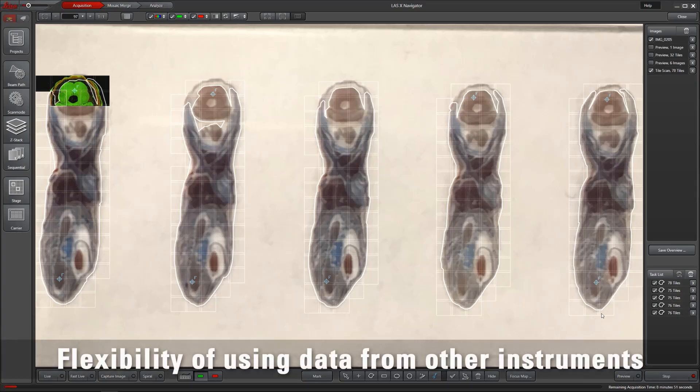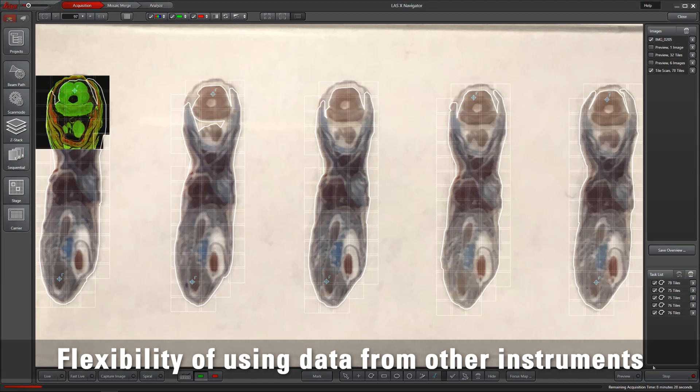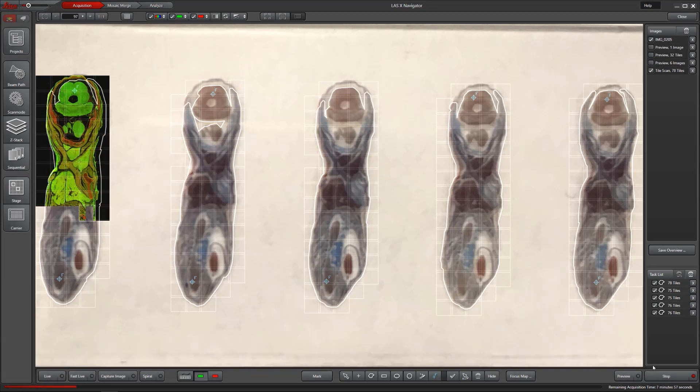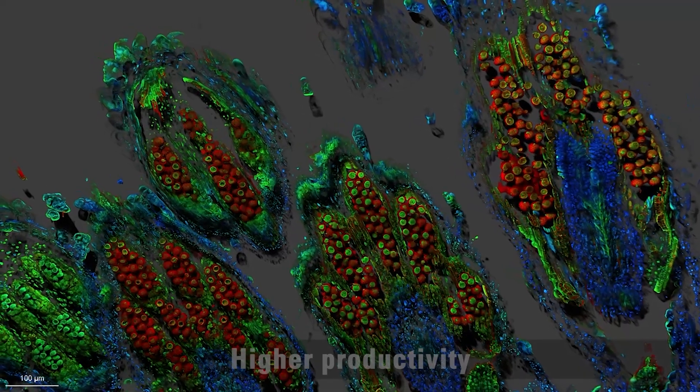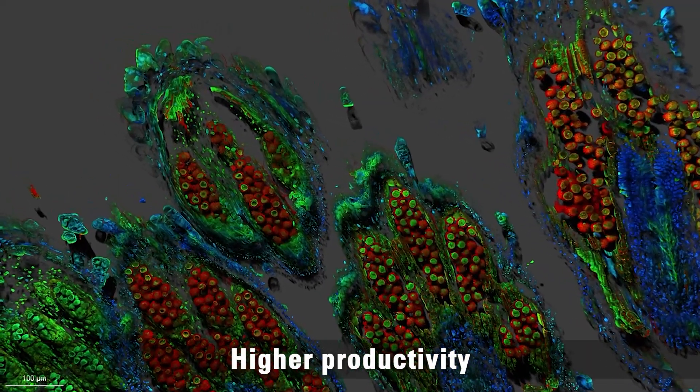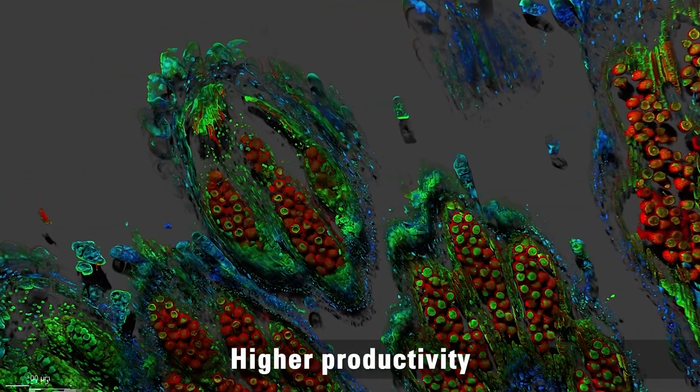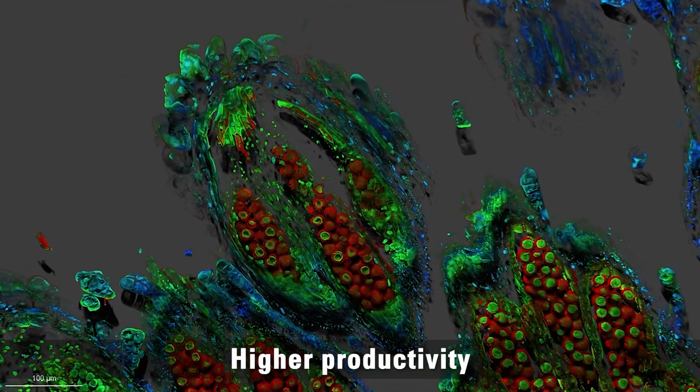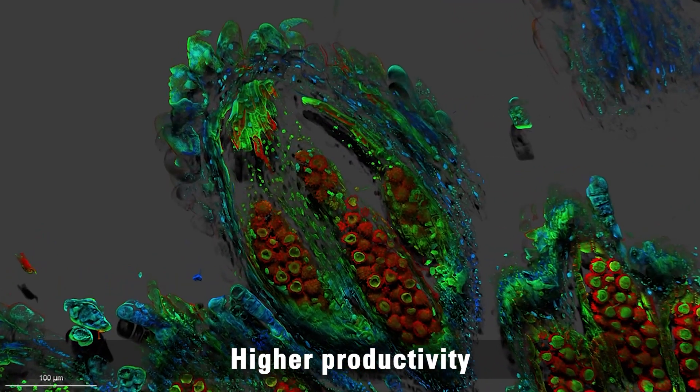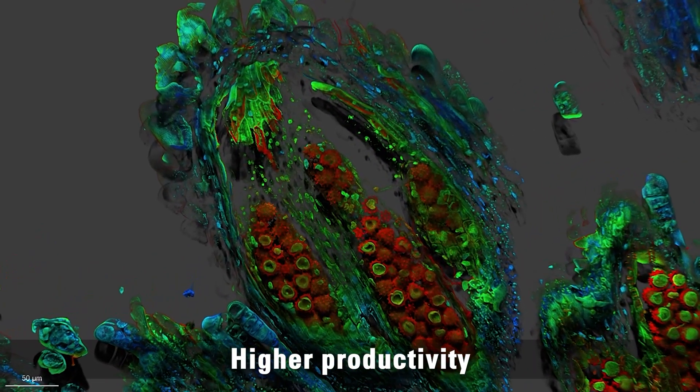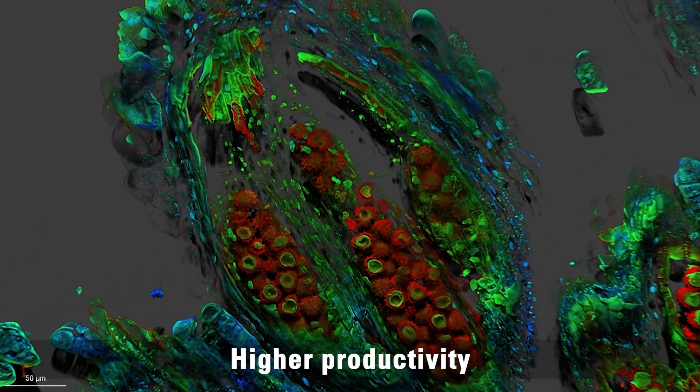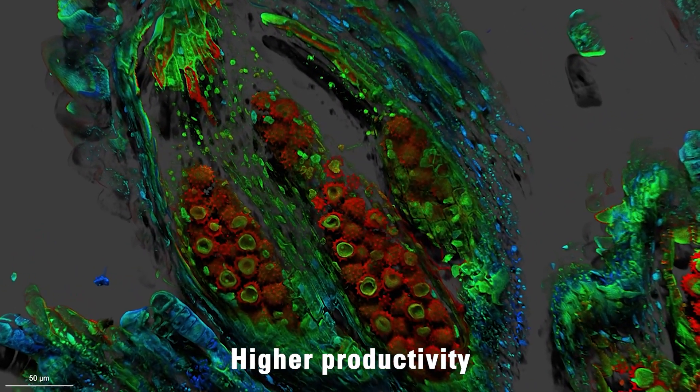The LASX Navigator user interface allows you to use images of your sample taken with other instruments. The LASX Navigator is a powerful tool that helps you get excellent research results quickly and gives you the productivity to do more.